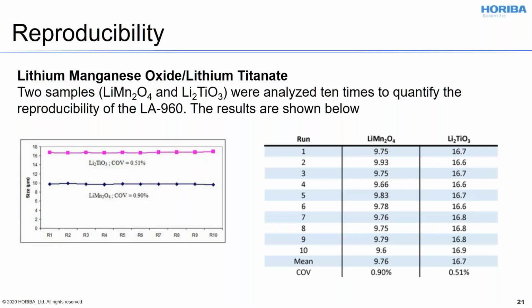You could also see some strange jumps around in the measured size if you drove the pumps high enough to entrain air. Another concern would be if you don't have a good surfactant choice, then you might see the determined size drift up as the particles start to stick together over time. And so this is the start of a method development, or probably the tail end of a method development effort, where you're making sure that, hey, do we get the same answer each time we measure the same sample?